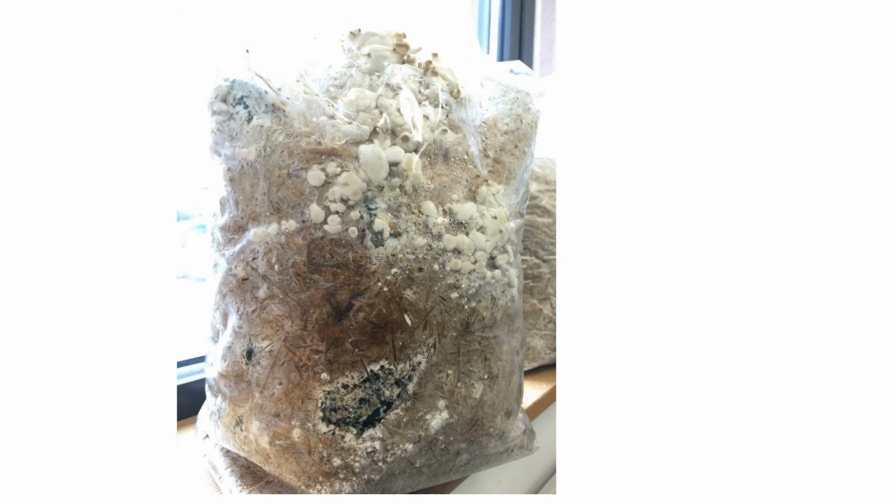You can do this with oyster mushroom because oyster mushroom grows really fast and they are aggressive colonizers of the straw. So they can outcompete a lot of the mold that finds its way onto the straw. Mold are certainly colonizing straw as well, but most don't grow as fast as the oyster mushroom. So the only thing that was produced using sterile technique in this method of growing oyster is the spawn. So the spawn should be colonized with the oyster mushroom and nothing else. Once you have the bag of spawn or jar of spawn open, you consider that contaminated, basically. So you want to use that up within a day or 2 days and inoculate all your bags, unless you're working under a laminar flow hood.